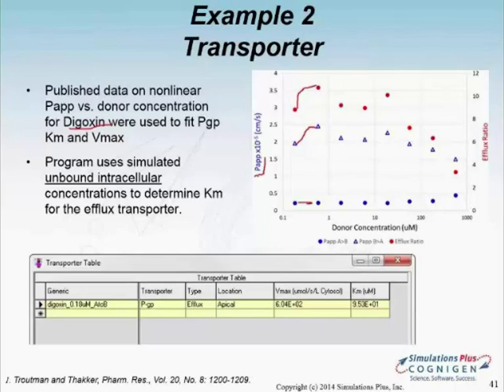Thank you, Viera. Another question: in your first example with propranolol, you dealt with lysosomal trapping without any involvement of transporters because this compound is not a ligand of transporters. In the second example, you dealt with PGP efflux without taking care of lysosomal trapping. How would you deal with a compound taking into account both mechanisms, lysosomal trapping and transporter involvement?